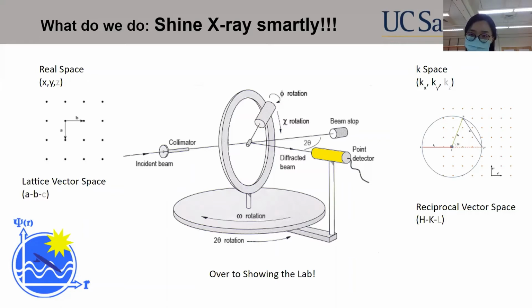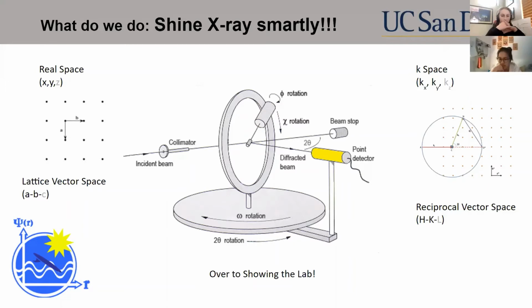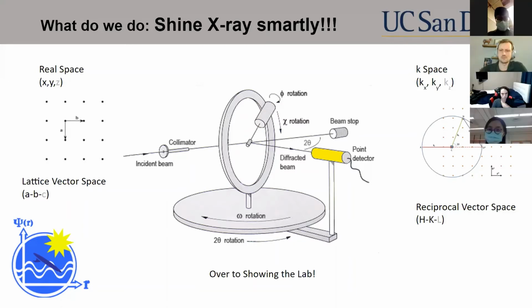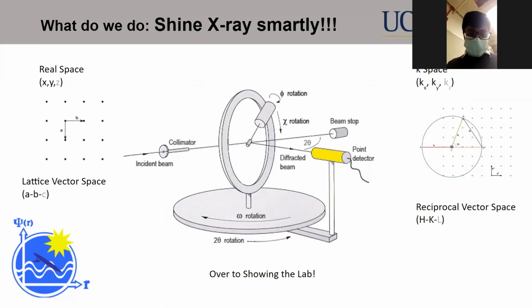So now I said that we define a rule of the land and try to create it, right? Using PLD. That was the whole purpose of PLD. But once we create it, we want to characterize it, to check that we actually happened to have created that rule of the land. In other words, the symmetry, the square lattice, you remember?